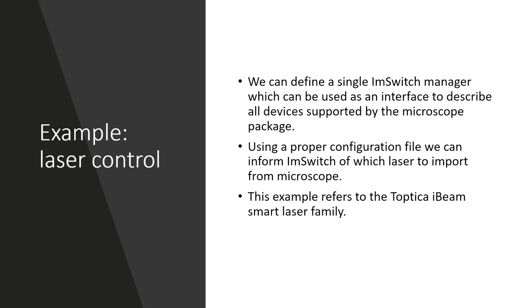We will use as an example the laser control functionalities of Python Microscope to create a single ImSwitch manager which can integrate all the lasers supported by Python Microscope without having to specify the exact device that we want to use. In this example, we will refer to the Toptica iBeam Smart laser, and we will show you how I integrated the manager into ImSwitch.